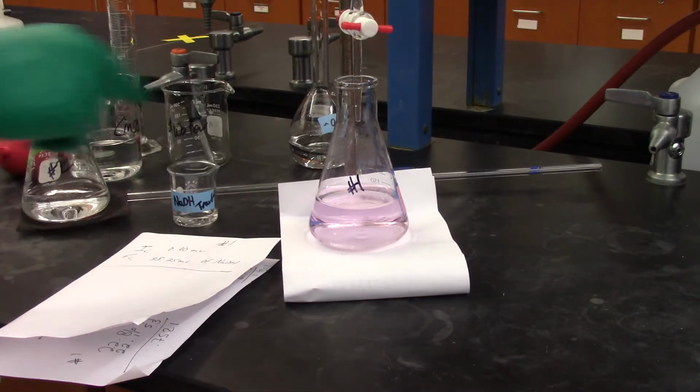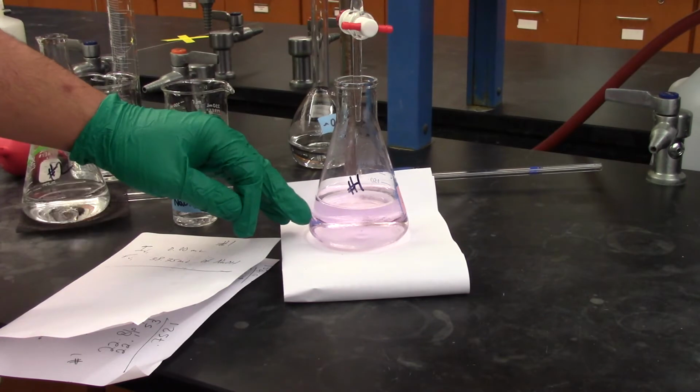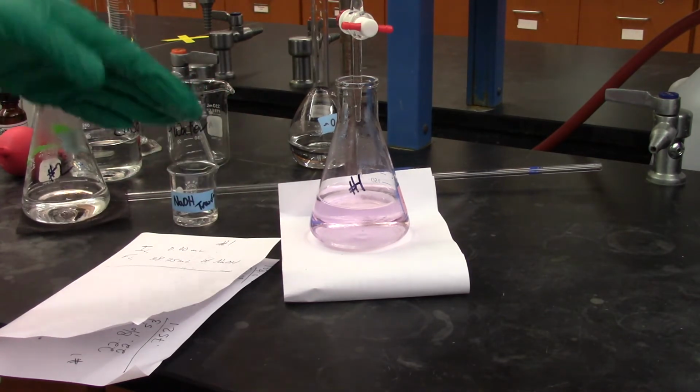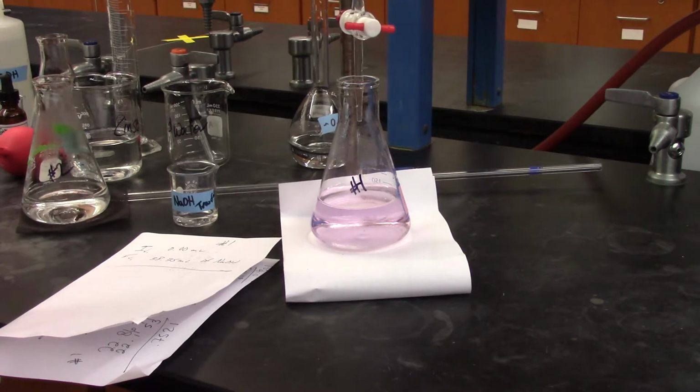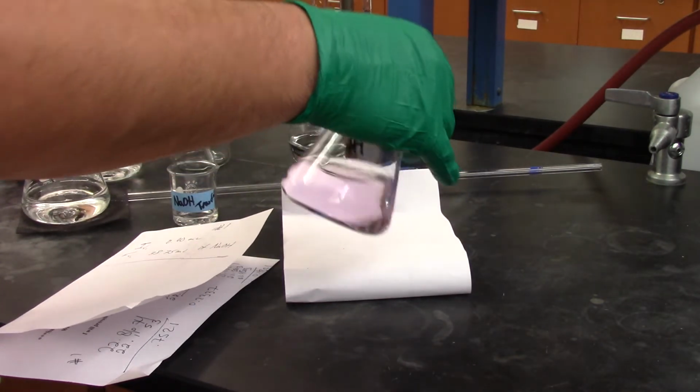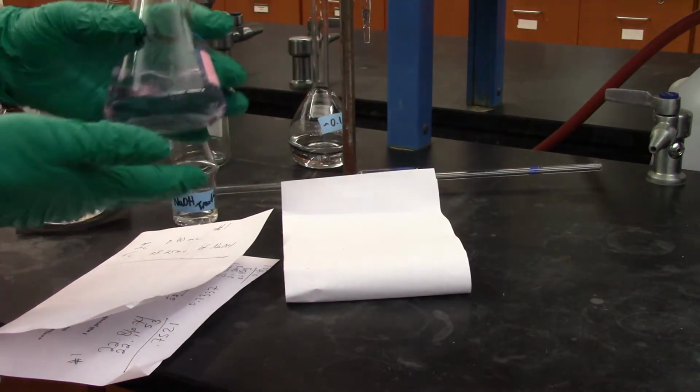So what I'm going to do here is we're going to have a waste up in the front for your reacted solutions. These contain phthalates, so we want to just take them to the waste. So we're going to take your flask here. This is going to go to the waste.